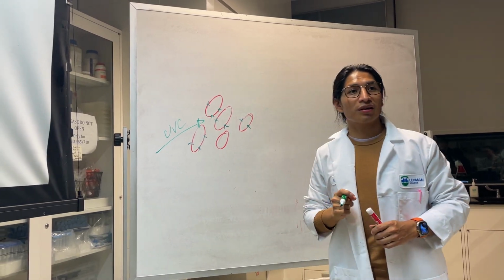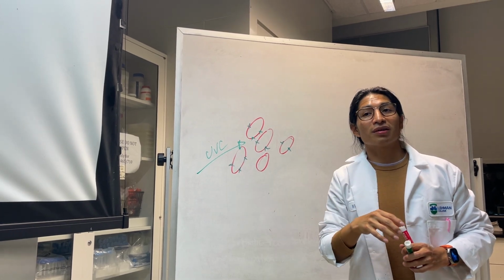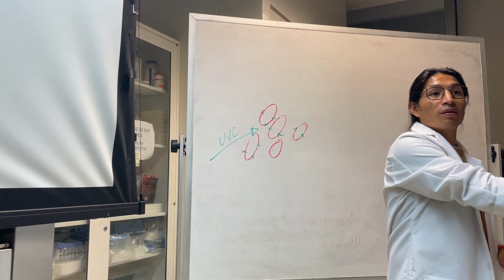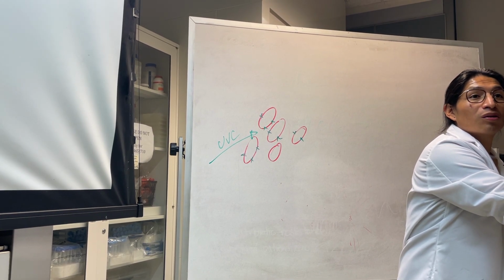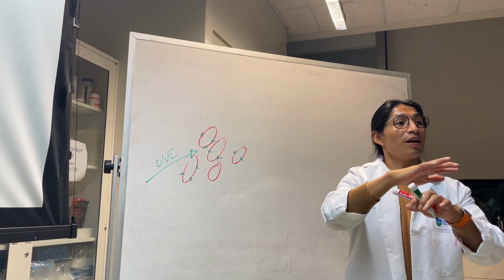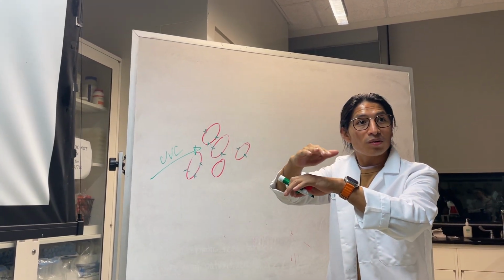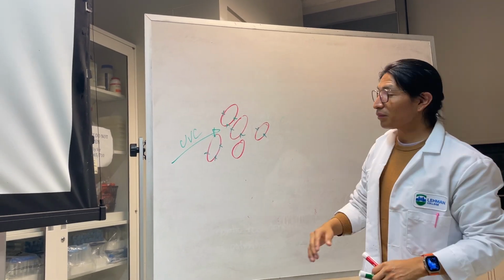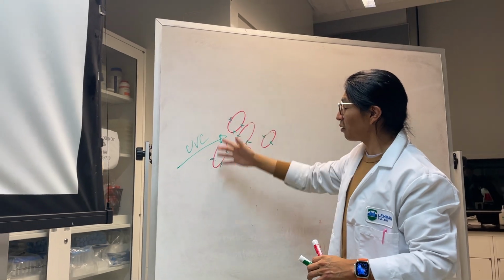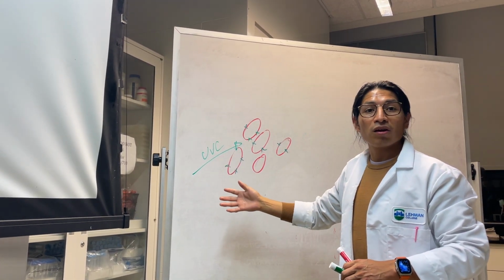But remember something else? Remember how many times we put bacteria? How many times? 2 to 4. For the UV. 3. 3, right? So that means that what? Layers. So bacteria is sitting on top of one on top of the other one. So when UV light hits, it will kill the bacteria that are at the surface, at the most surface.